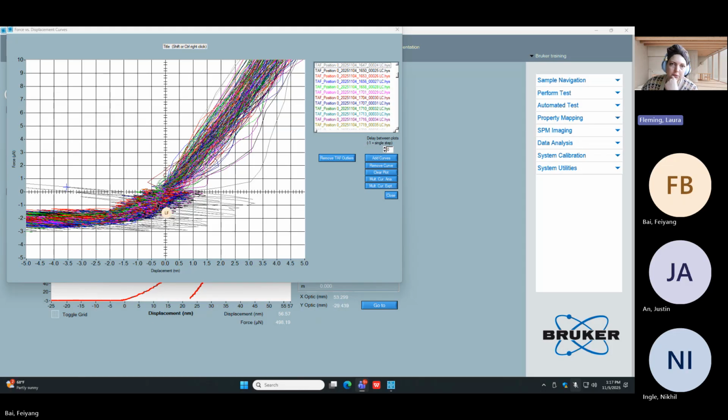It's also offset in displacement because of that contact threshold. So truly, here we can see, it came in, it lifted out, and here is where we are finally leaving the sample surface. And that means that when we come back in, here is where we're really re-entering the sample, about right there. So this means we have to re-zero our curves. So I'm trying to demonstrate that this is necessary for every indent, even though we're only off by about -2 micronewtons and -2 nanometers. It's enough to create error in our measurements.